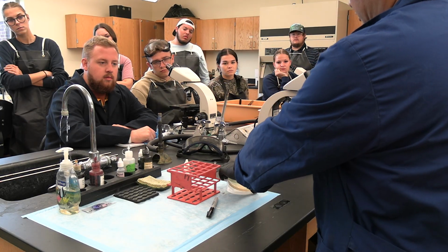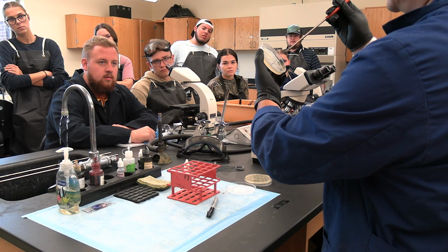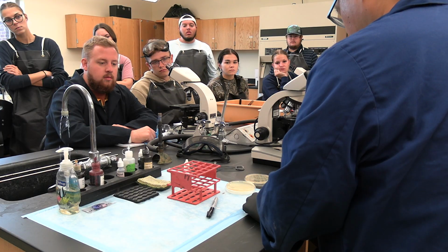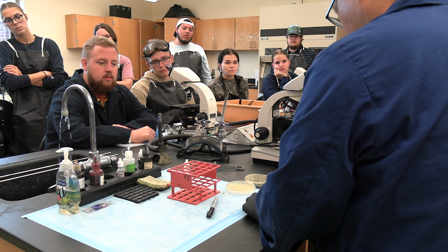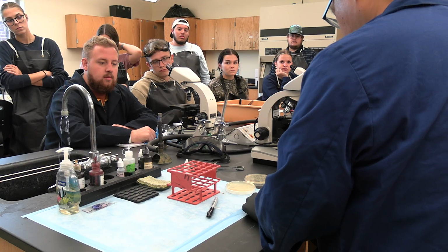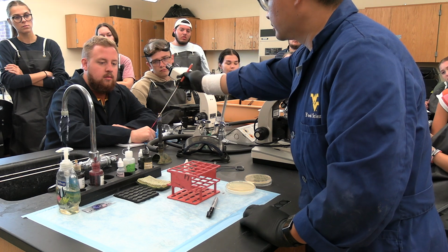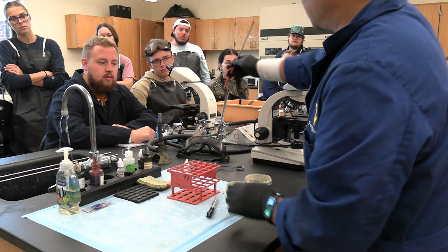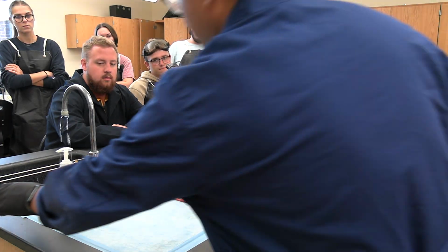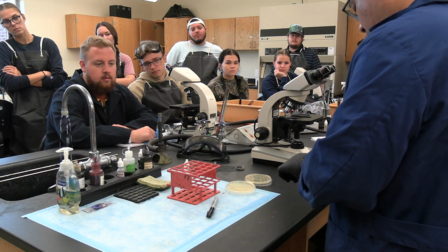Cool down a little bit. Want to get the E. faecalis. So here, we're going to make a big circle. Then flame the loop again. Now we put it on the side. Now let's do an air dry first. The air dry is 3 to 5 minutes. Let's say this air dry is ready.